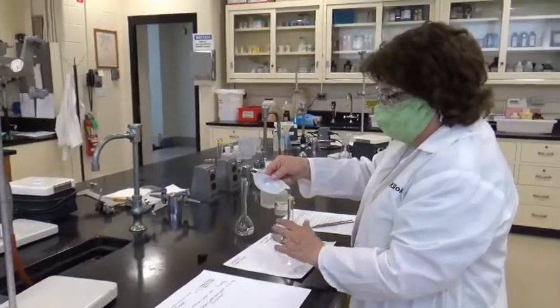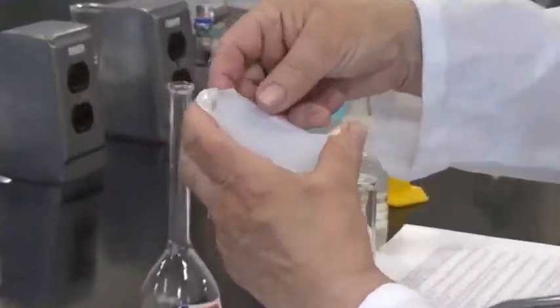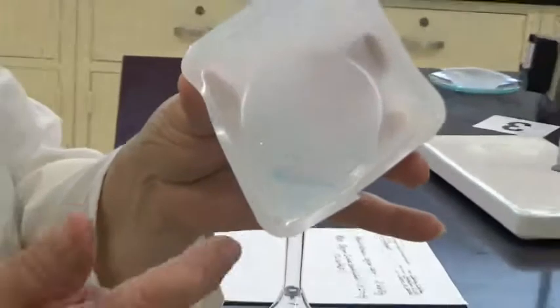And we have to carefully transfer the unknown to the volumetric flask. Now we don't want to drop any, so you have to be very patient. Did a good job. Now, see, there's still some in there.